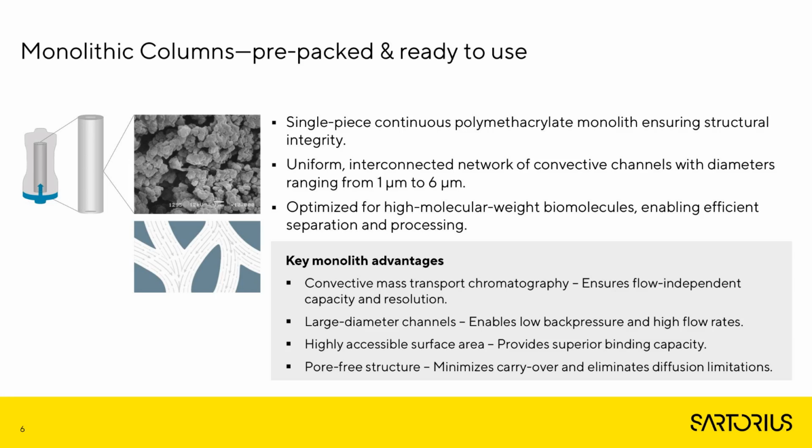So they are uniform monoliths. They have channels, not pores, in an interconnected network of channels. There is really no dead volume, which enables low back pressure and high flow rates.